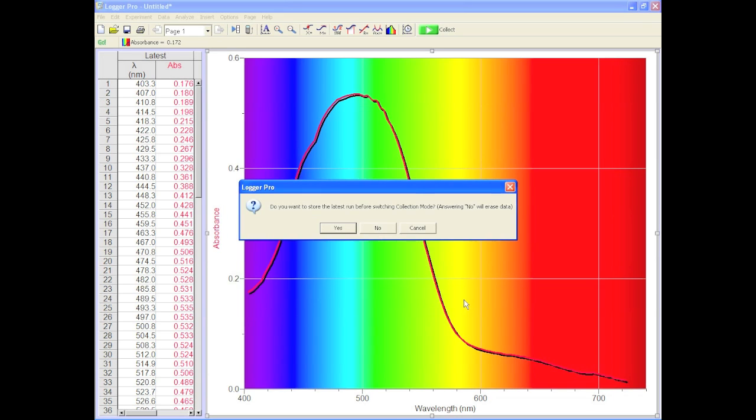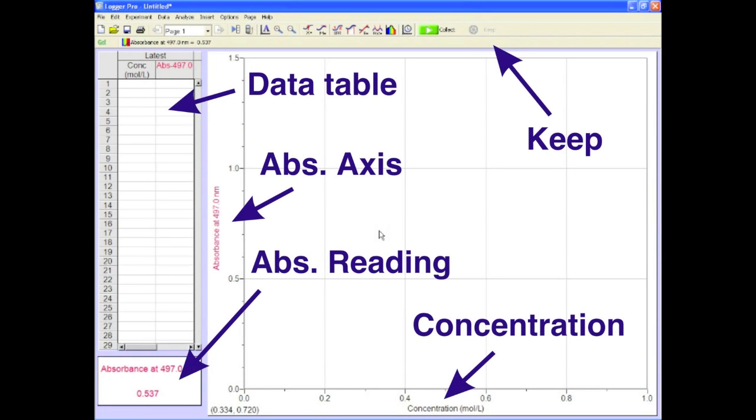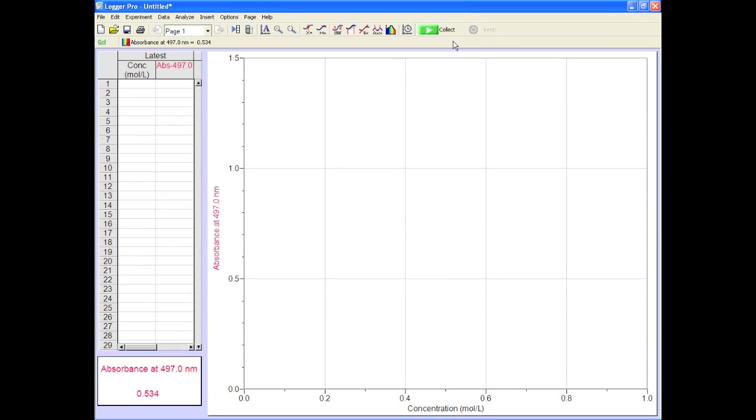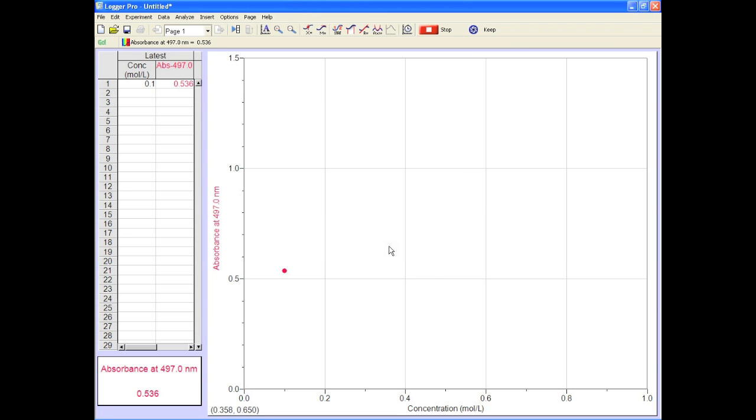You can save your data or discard it. Whatever works for you. Nice. Now you're ready to roll. Check out these areas of the screen, they're important, especially the Keep button. Now press Collect and notice the Keep button is lit up. Give it a push and type in the concentration of standard you have in the spec. It should still be your highest one. OK. Notice that the point on the graph moves accordingly.